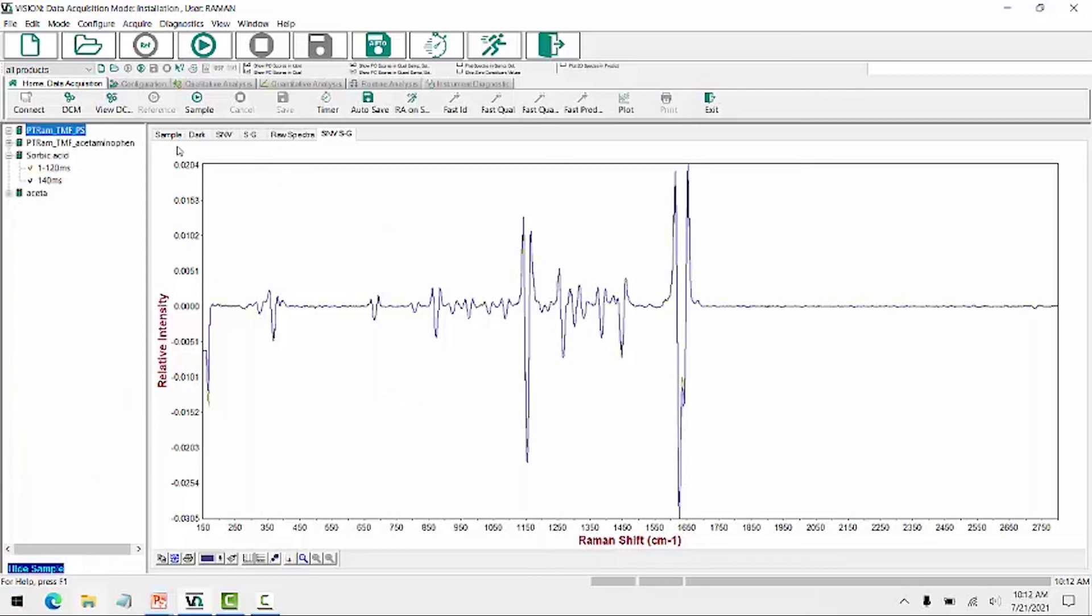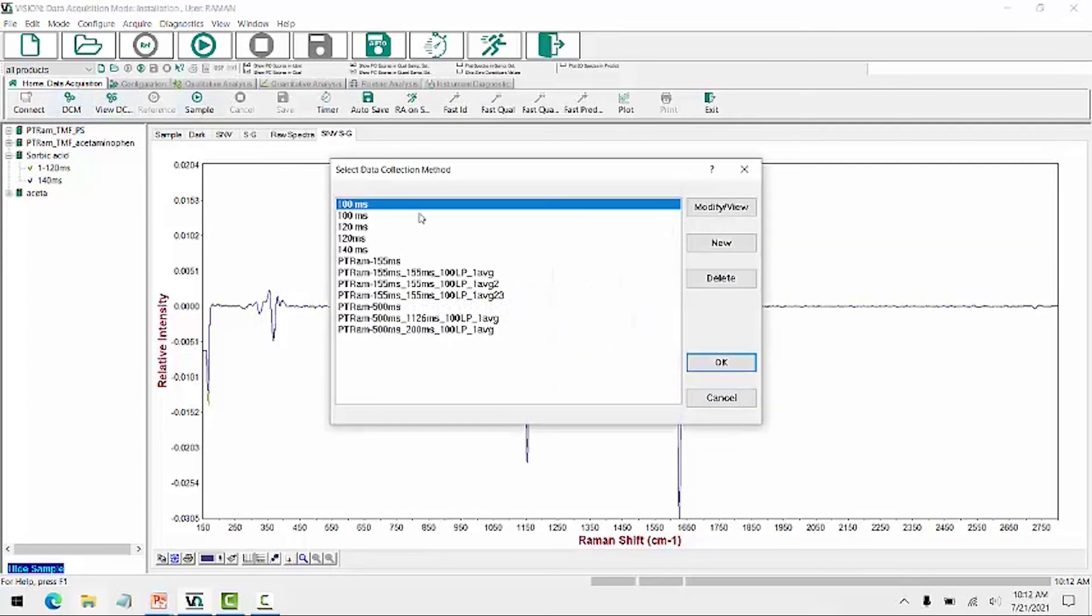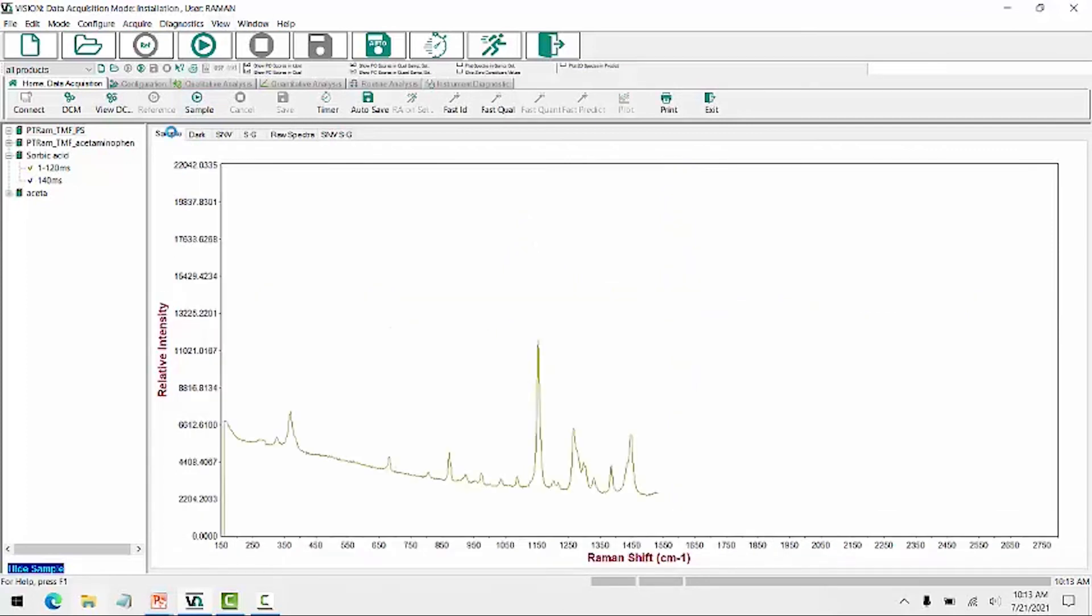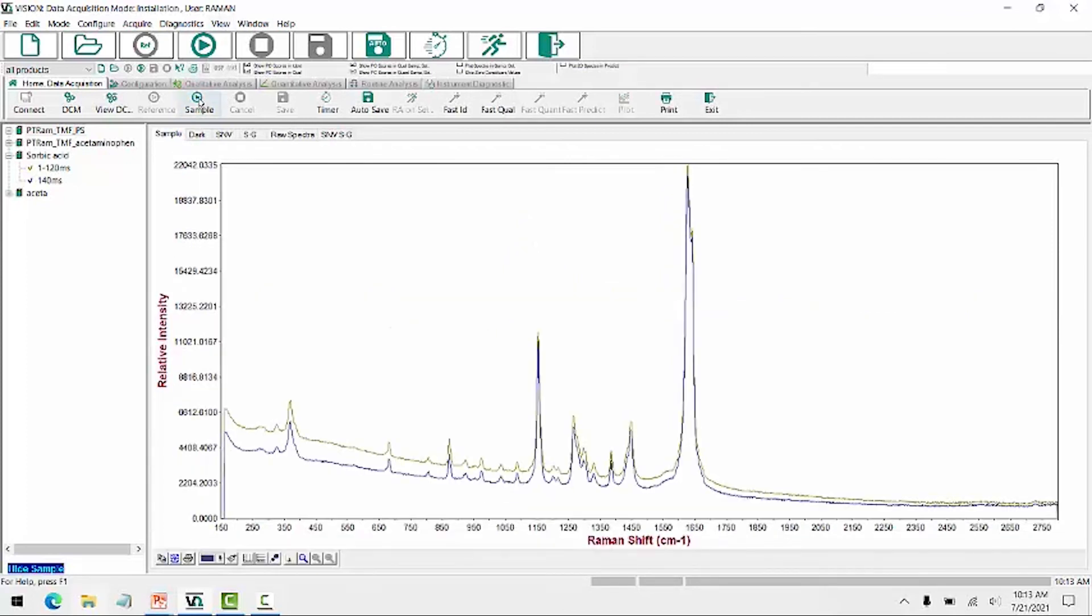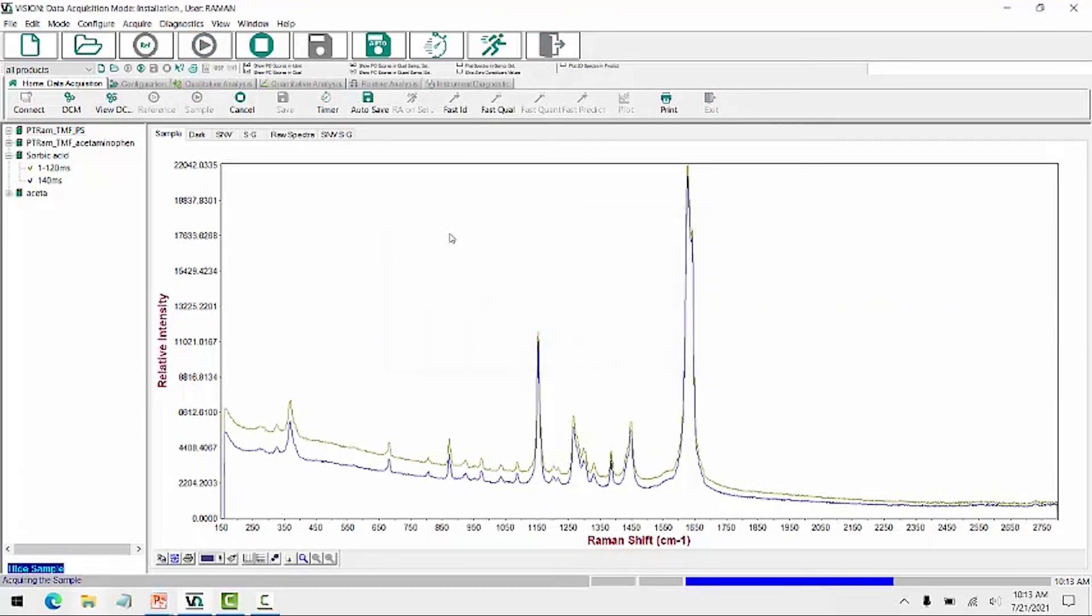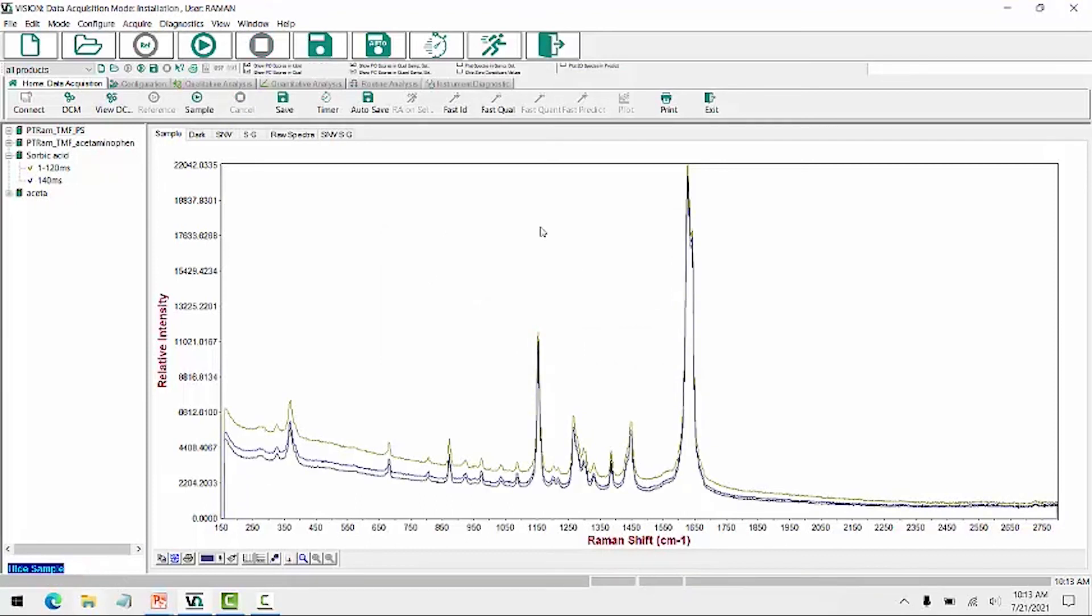So again, to collect our sample spectra, we need to create a DCM or select an existing DCM. So I can select a DCM, and then I can collect a sample spectra. Now I'm scanning a sample of sorbic acid again. So collecting that sample, again, it first runs the Raman shift, the reference, and then the sample itself. And here it's overlaid, and I can save that sample scan.